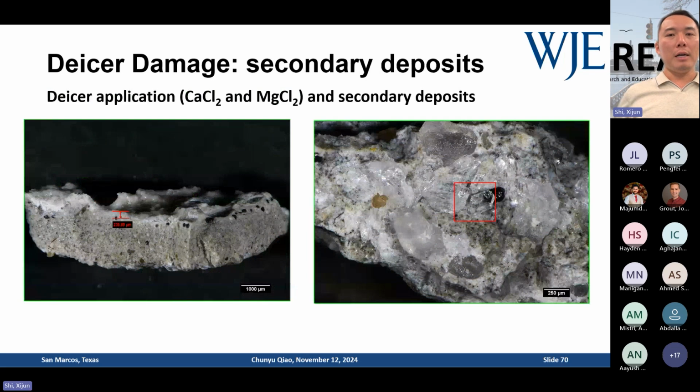And also, when I look at the pieces, like I said, they're pieces, they're not really a core, right? So you see this piece. This piece has a kind of white crust on the top, you see on the image on the left. And also when you break a fracture surface on the right, you see some clean, clear, very well-shaped crystals lining the fractures or cracks.